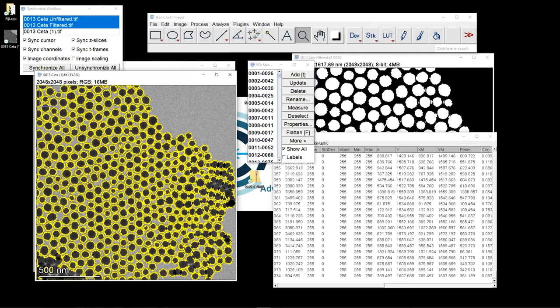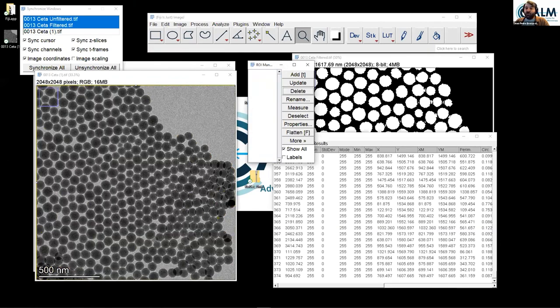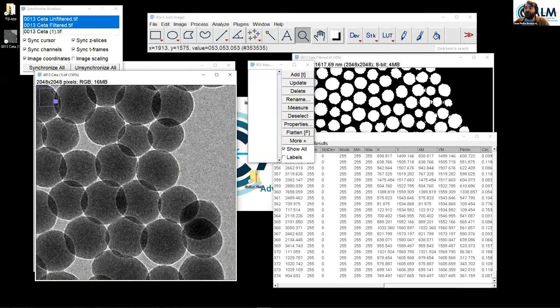So one thing that is important for the challenge that we propose. If I may remind you, the question that we have for you is, can you think of ways to make sense of these overlaps? In here we have particles which are clearly overlapping one another. So is there anything that we can think of that could help us discern individual particles? I'm not going to give you the solution, but I'm just going to point towards the one thing that you can do with the different ROIs.